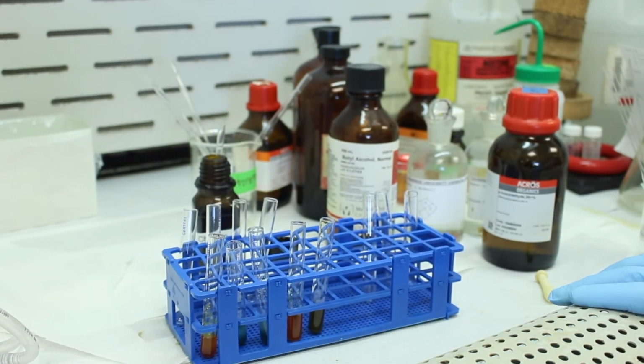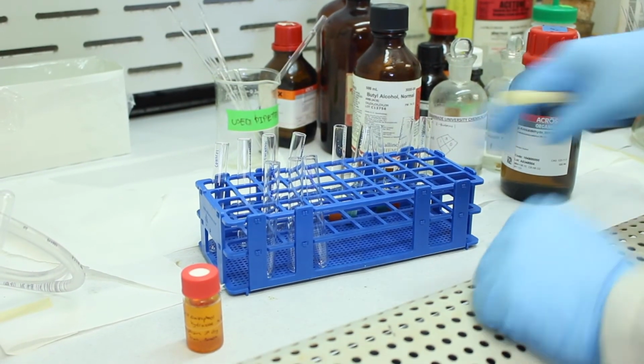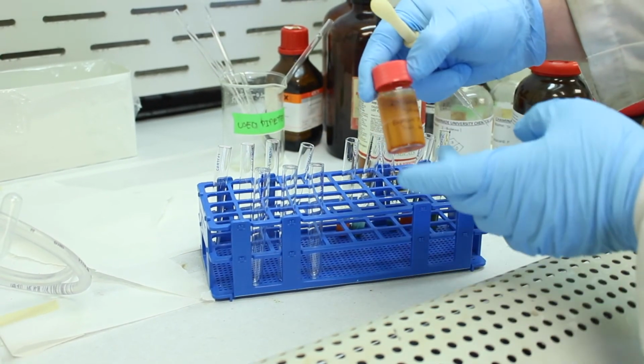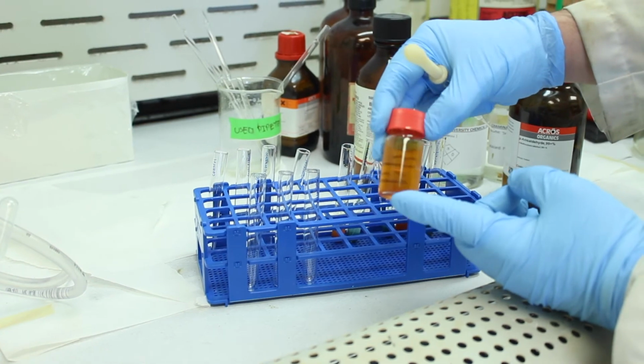Okay, now we're going to move on to our DNP tests. All right, now we're going to do our DNP tests. So this is the DNP solution, 2,4-dinitrophenylhydrazine. It's an orange solution. There's a little bit of it that's solidified in the bottom.